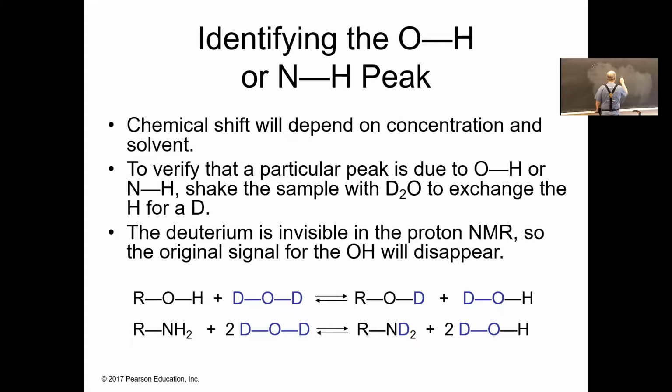One that is very commonly used is what we call chloroform D. The hydrogen has been replaced by the deuterium.